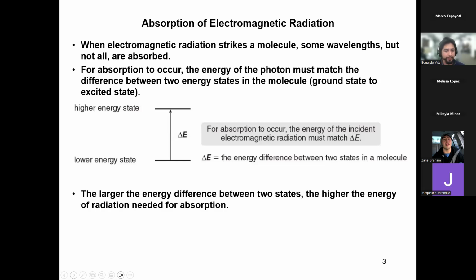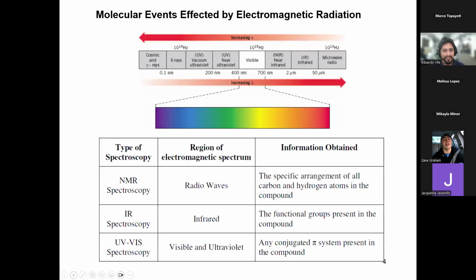Okay. So anyway, as I mentioned, we have an entire range of electromagnetic spectra. You can see here, some of you asked me last week, what's that machine in the room? The one that has like a giant tube and says don't get near it because it has a giant magnet. That is called a nuclear magnetic resonance spectrometer, or NMR.